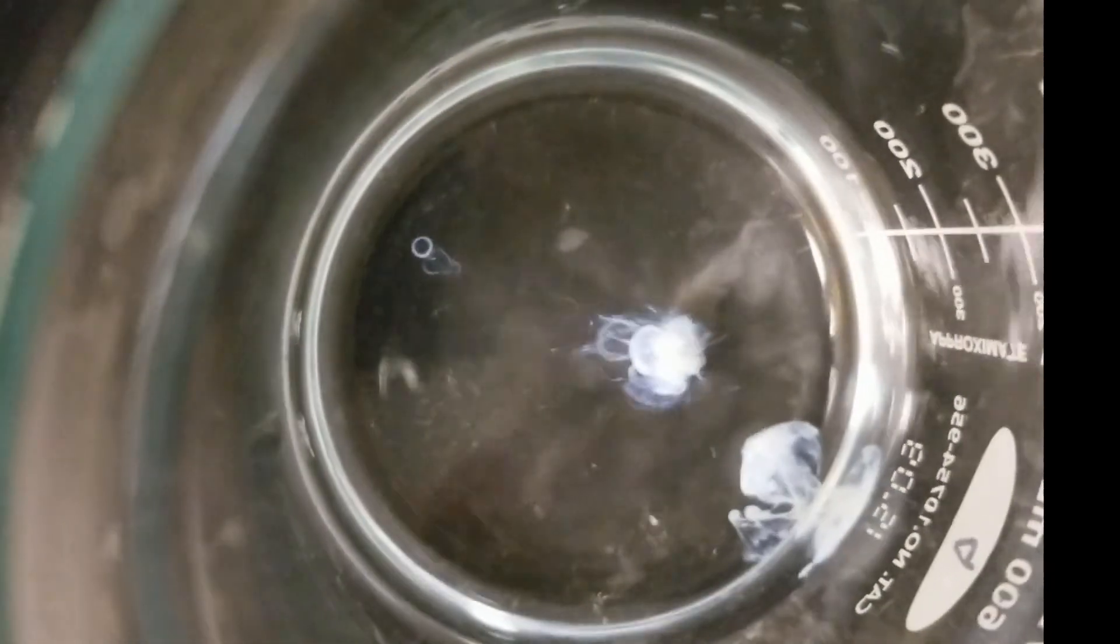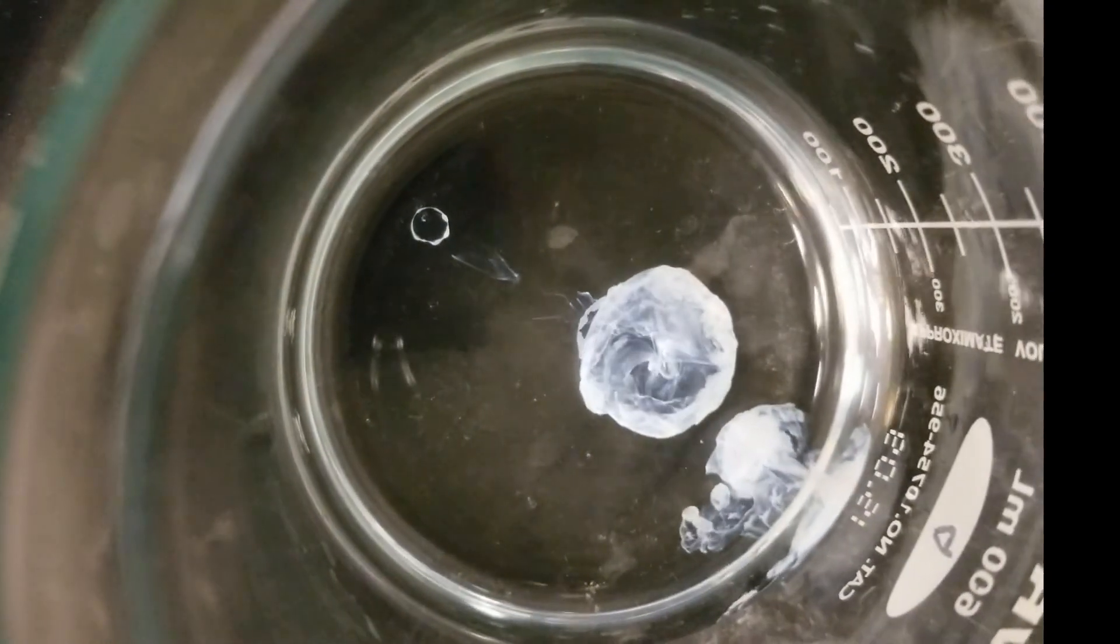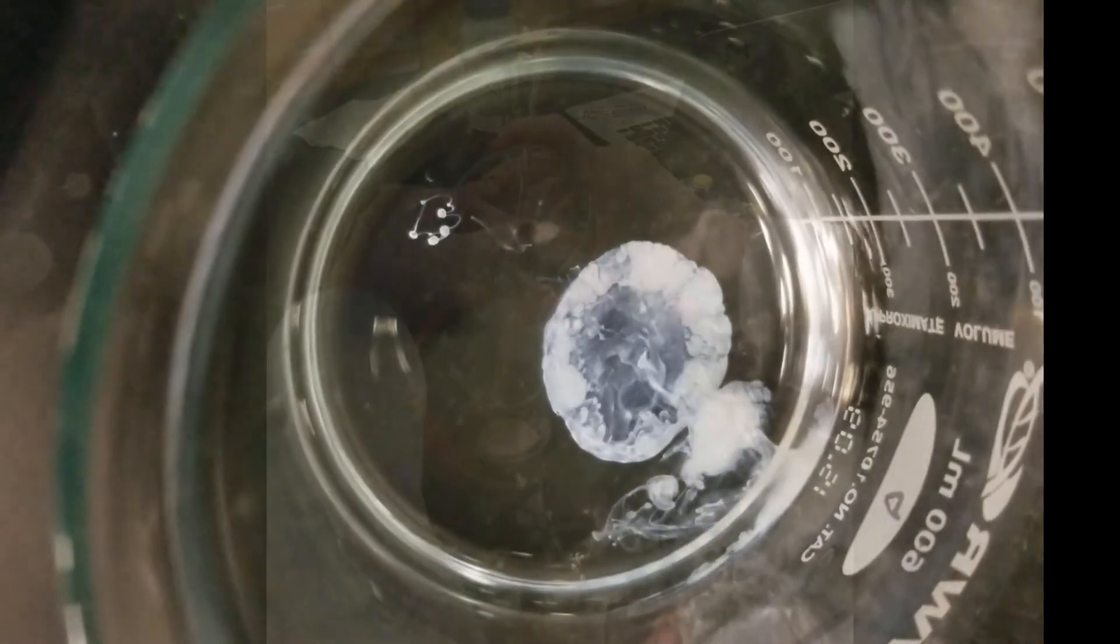Next, test your solution for free chloride ions by dropping in a few drops of silver nitrate. If you see a cloud like this, you'll need to digest more.